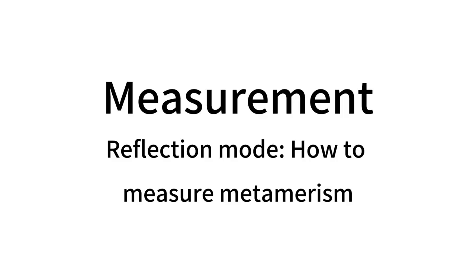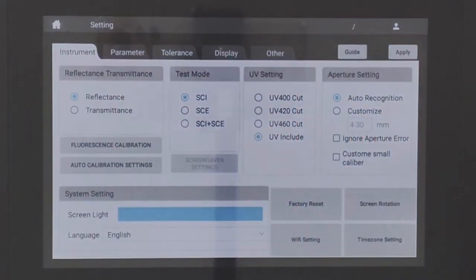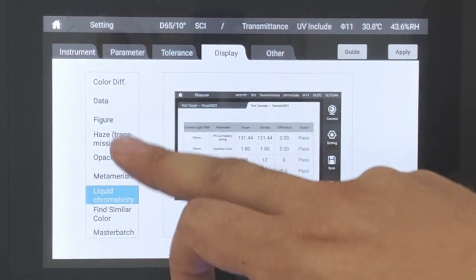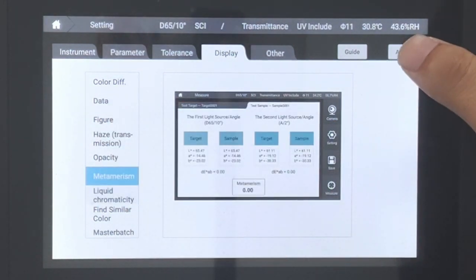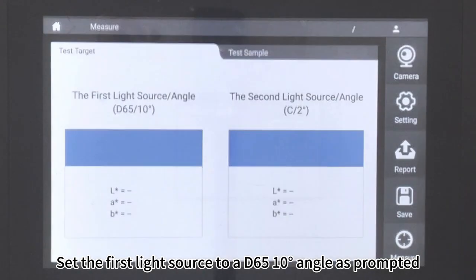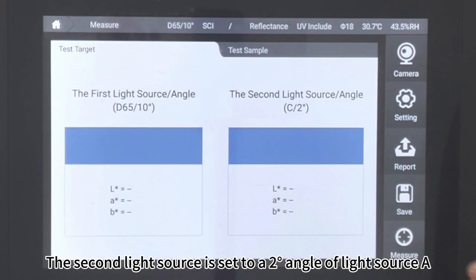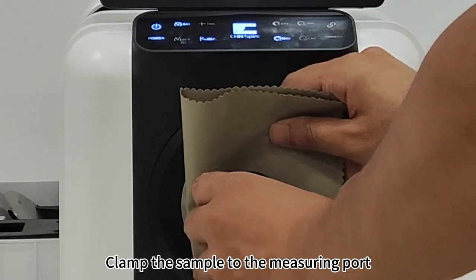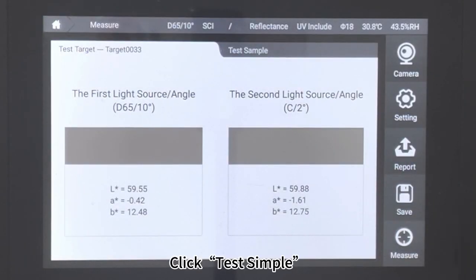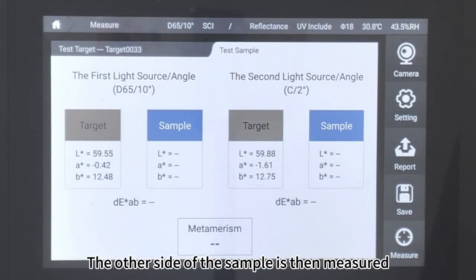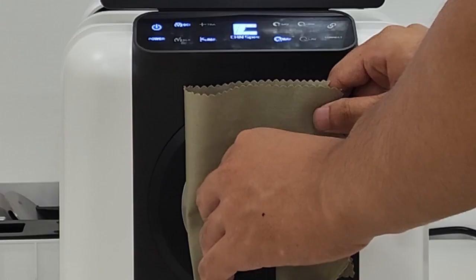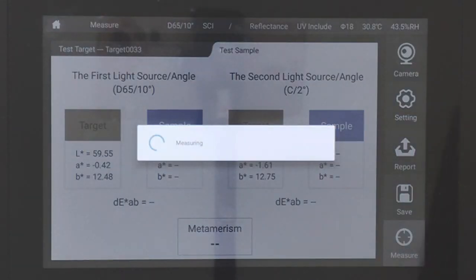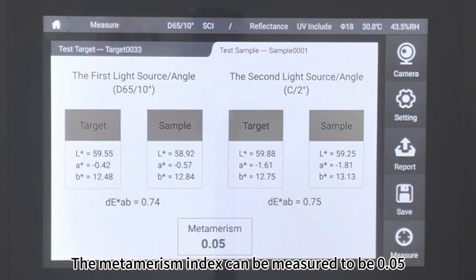Reflection Mode. How to measure metamerism: Click Setting, then click Display. Click Metamerism. Set the first light source to D65 at 10° angle as prompted. The second light source is set to a 2° angle of light source A. Clamp the sample to the measuring port and click Measure. Click Test Sample, then measure the other side of the sample. Click Measure. The metamerism index is measured to be 0.05.